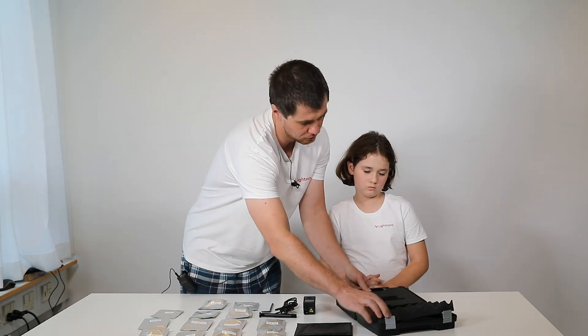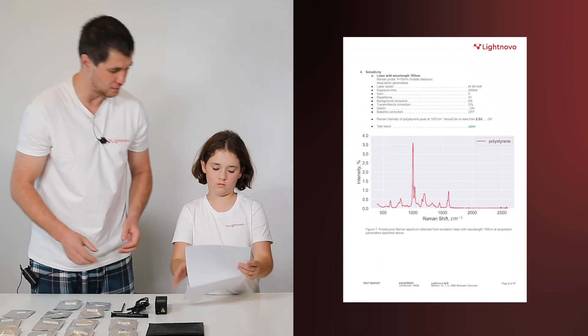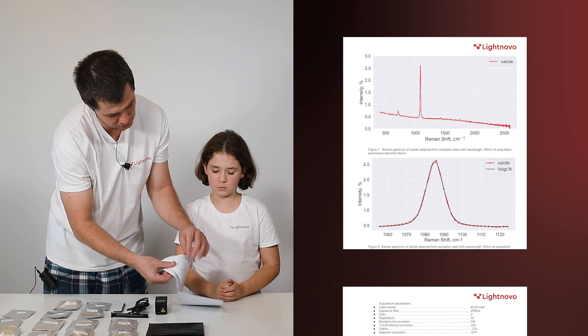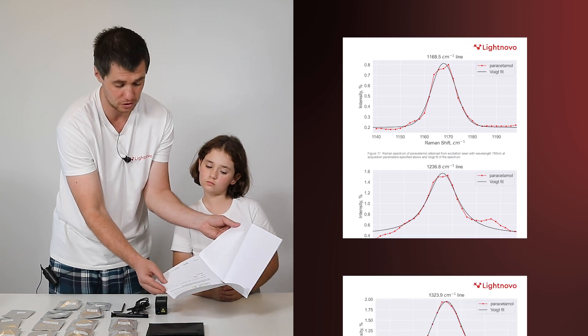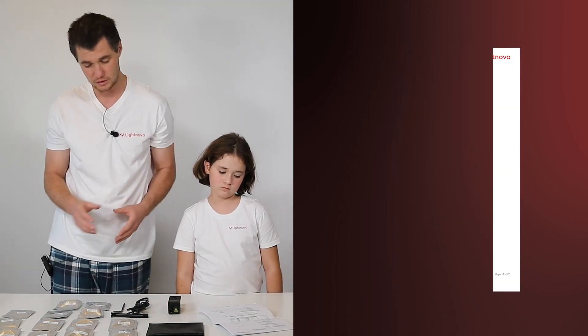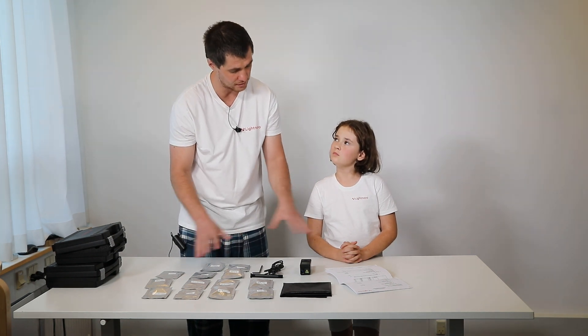We also have one more document. If you receive Miniraman, you will get a document inside — a certificate of quality for the Miniraman spectrometer, where you will get all details of Raman shift calibration accuracy: polystyrene measured with our calibration tool, with the first laser and the second laser, and the signature of the service engineer who did the testing. You can use this document every time you are unsure about the Miniraman performance. So in the next step, let us open all these accessories and see how we can attach them to Miniraman.